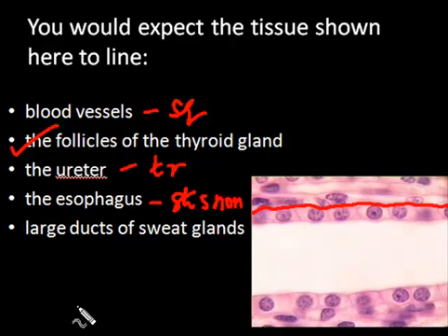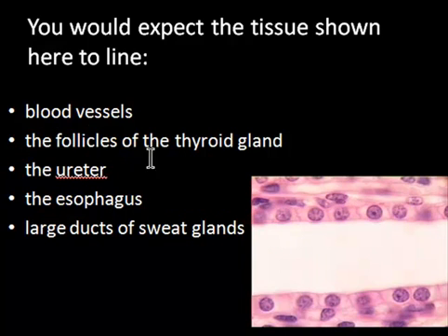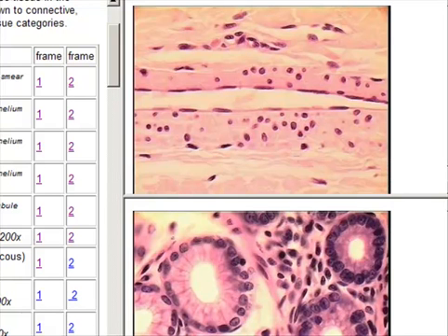And just to show you how these other epithelia differ from the one shown here, I'm going to the site from where that image was taken, and here this is showing you simple squamous epithelium, where you see this is the basement membrane, and here you're looking at the nuclei of squamous cells.